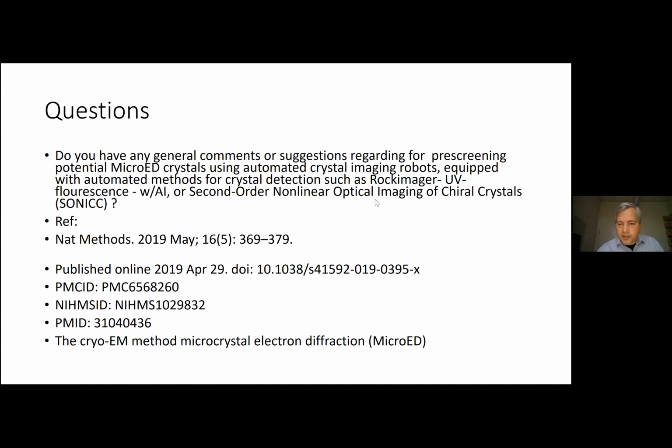Let's see, I can go to the chat questions now. So the first chat question is, to form the microcrystals, do you need as much sample as when you make crystals for crystallography? I think so, yeah, because you need to have enough. Even if the protein crystals are small, there needs to be a high enough concentration that you're forcing the protein to crystallize out of solution.